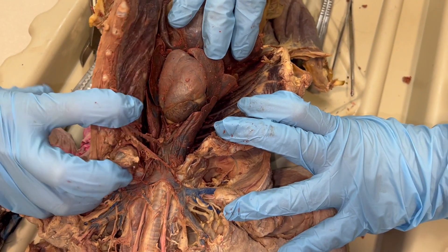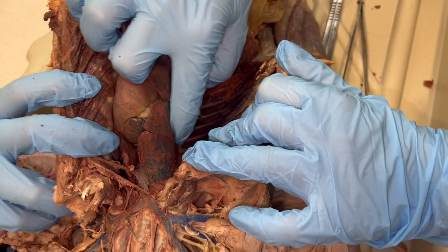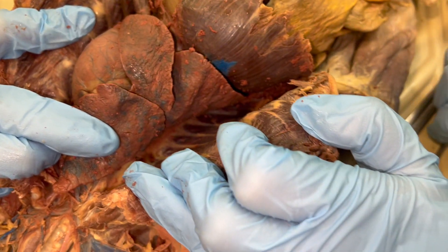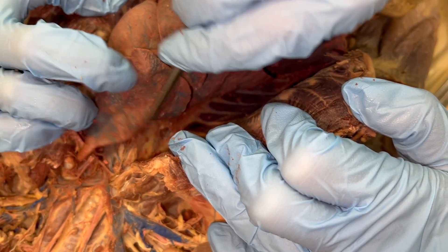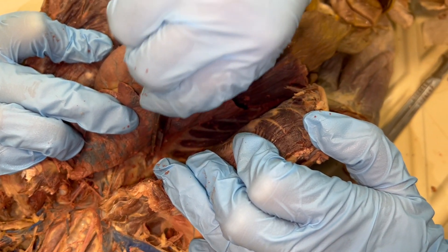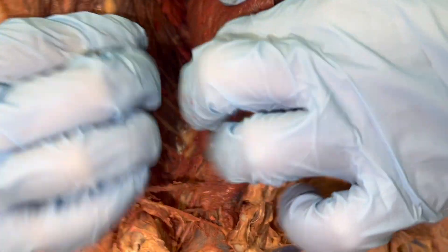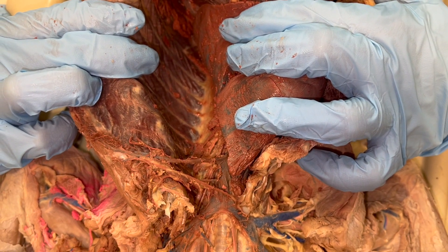We want to be able to see the azygous vein. To do that, we're going to have to push the lungs on the right side way over to your cat's left, and dissect into this area to see a large vein that's traveling behind the lungs. You will also see intercostal veins and arteries here. Then we'll do a similar thing on the other side — push the lungs all the way over to the right and dissect behind there. That's where you'll find the descending aorta.